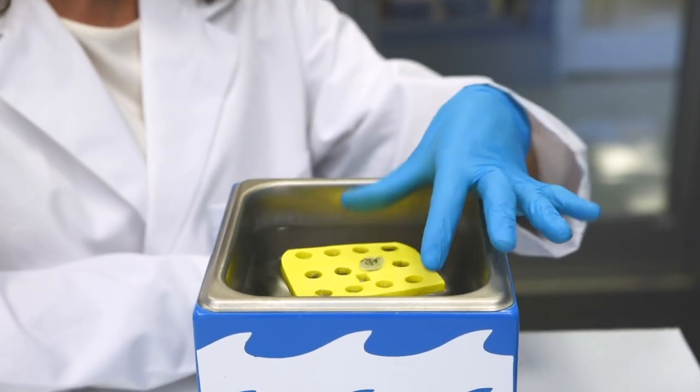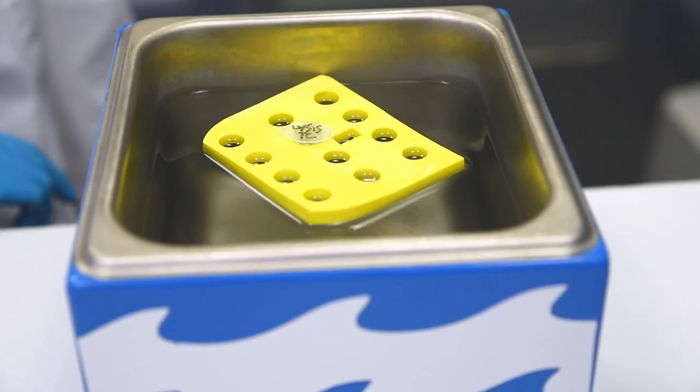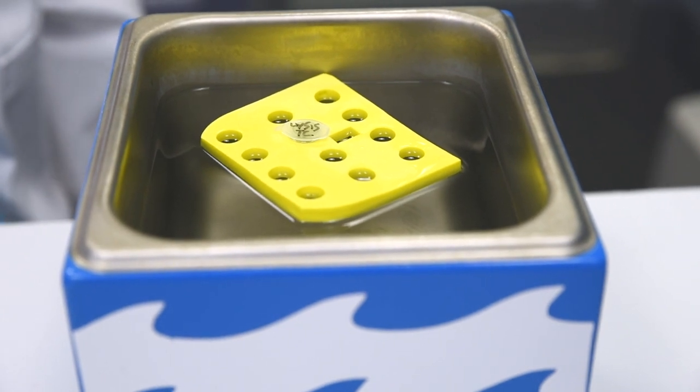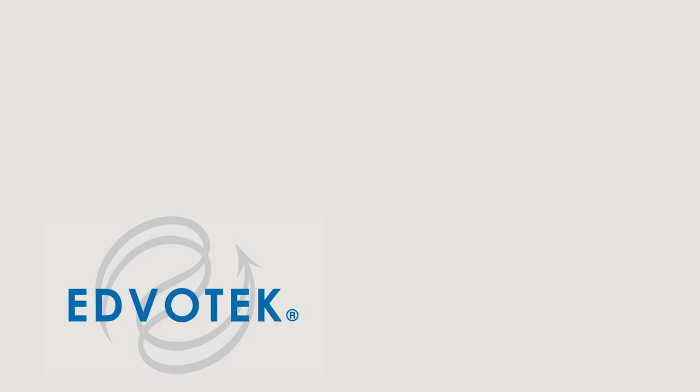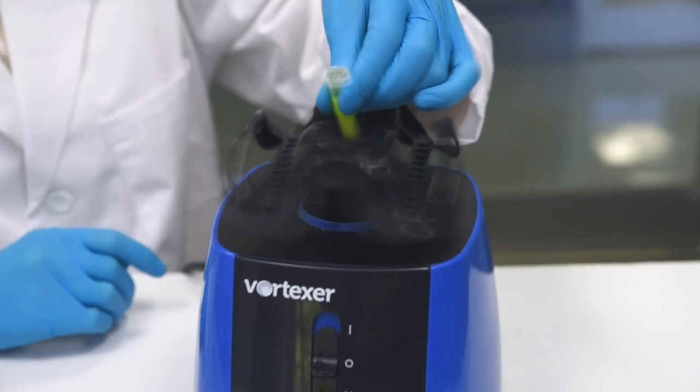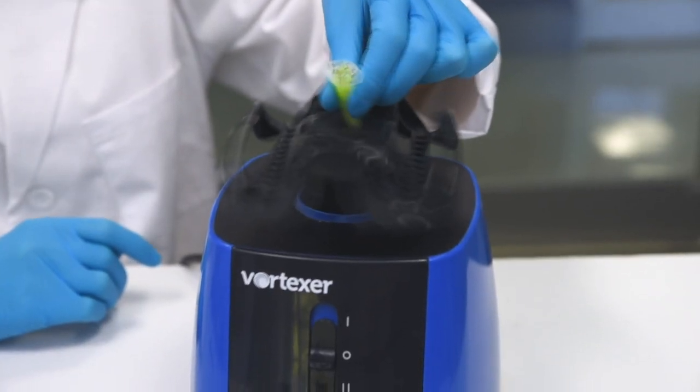Step 7: After the cell suspension is completely frozen, remove the microcentrifuge tube from the freezer and float it in a 37 degrees Celsius water bath to thaw the cells. Step 8: Vortex the samples vigorously for 30 seconds.